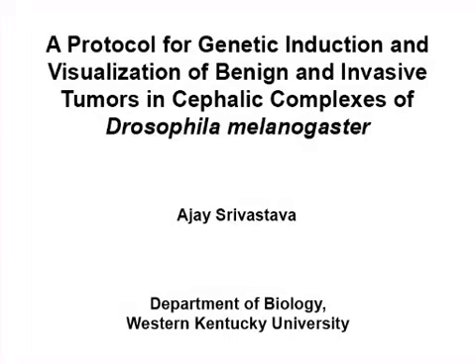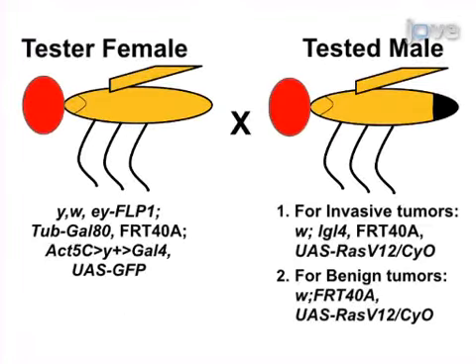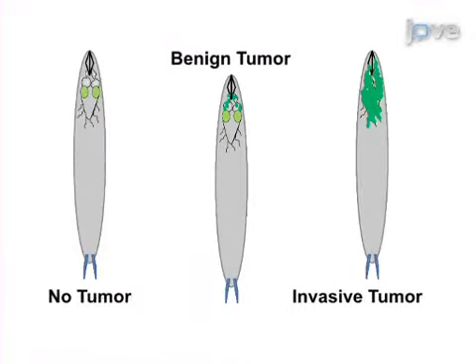The overall goal of this procedure is to induce benign and invasive tumors in Drosophila, and then visualize them by dissecting the larval cephalic complex. This begins with setting up a cross between the desired strains and isolating the larval progeny bearing either the invasive or benign tumors.